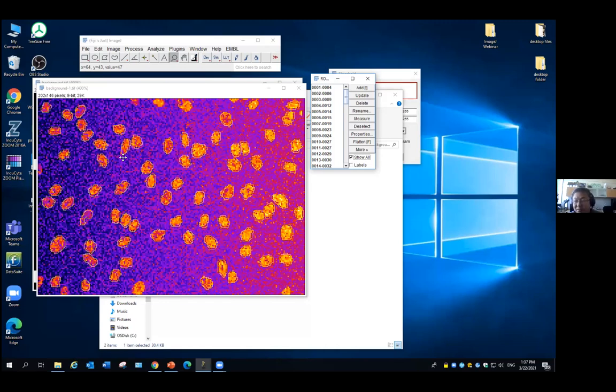You can basically get an image which is not ideal to directly use thresholding to separate into object and background. Okay? And always, if you get a non-ideal image to do your image analysis, first always ask yourself: have I done all I can on the microscope side to get the best raw image? You always ask this. Always try to get the best image you can work with to start. That makes your life much easier, and your results much more reliable and consistent.